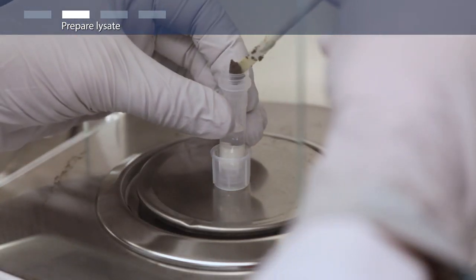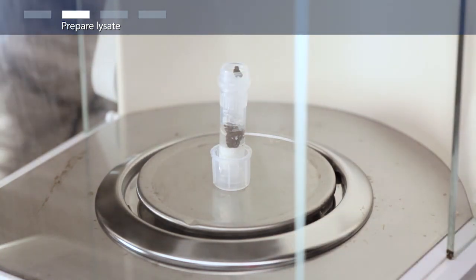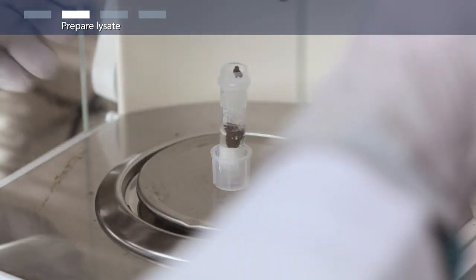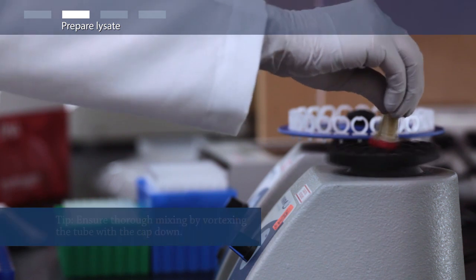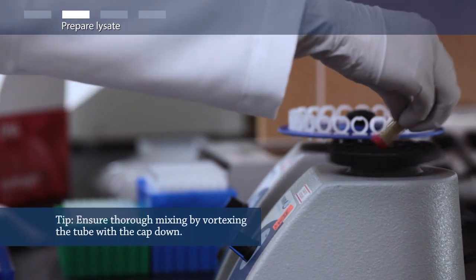First, add 0.2 grams of the stool sample and 600 microliters of lysis buffer to the bead tube. Vortex until the sample is thoroughly dispersed in the liquid.